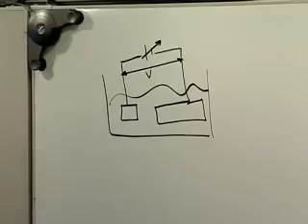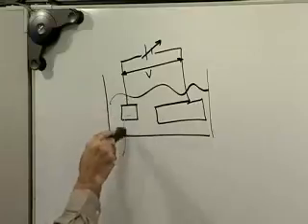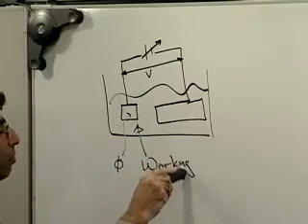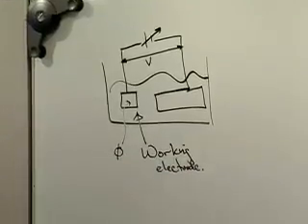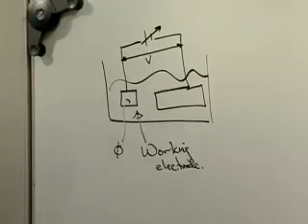No problem. And this experiment will work under the same conditions. However, can anybody think of a reaction that only goes to one product at 1,000 degrees? You know, maybe you'll only go to one product at 1,000 degrees, but not the one you want. Typically, you've got lots of possibilities, and the way we want to access those possibilities is by not controlling the voltage, but controlling the potential of this electrode. We'll make this our working electrode. So if we can control that well, then if there's 29 different reactions that might happen, presumably we could pick out the one that we were interested in, by knowing exactly what potential would give us a rate constant for the reaction of interest, that would be suitable, okay, and not rate constants for other reactions that would be suitable.